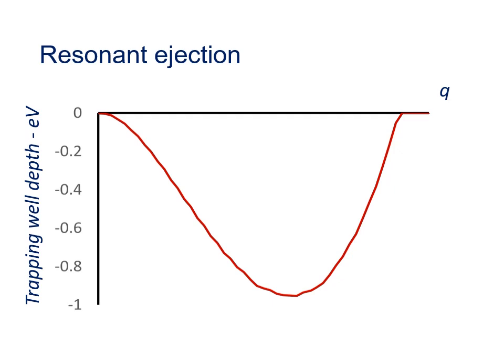But in real life, the ion cloud will have a temperature. What this means is that some of the ions of a given mass and therefore a given Q value will sit as deep in the energy well as they can, but other ions will start slightly higher up. They'll be nearer the edge of the trapping well. Now, as we run the RF ramp, both of these ions, remember with the same mass to charge ratio, will move together towards the boundary.